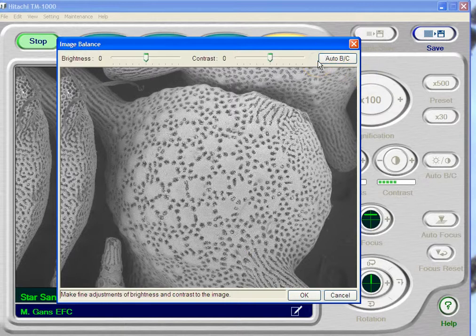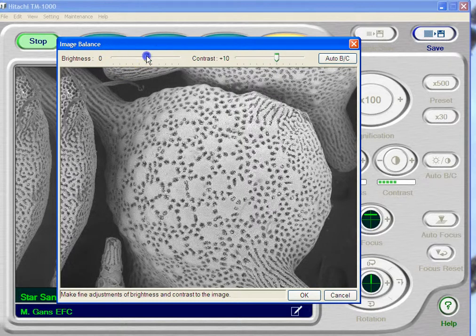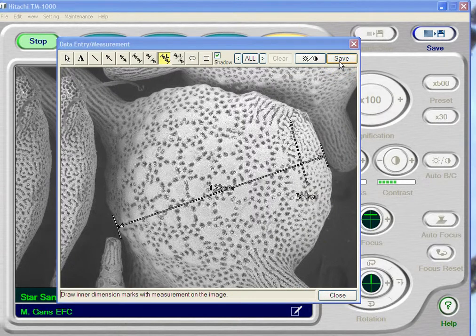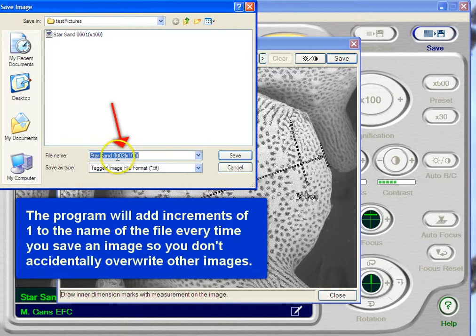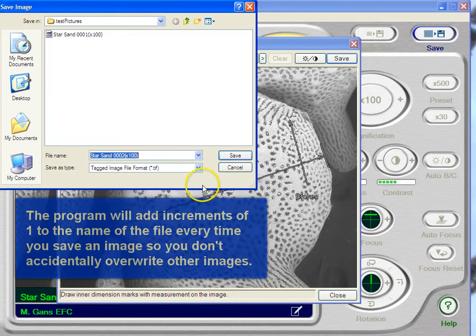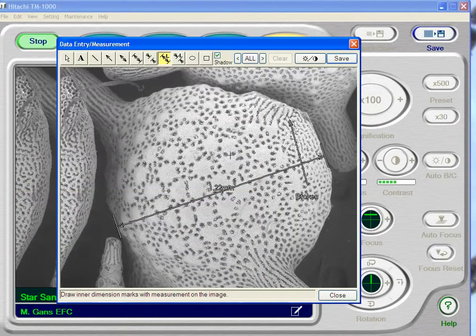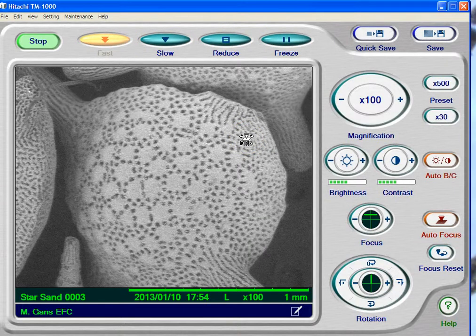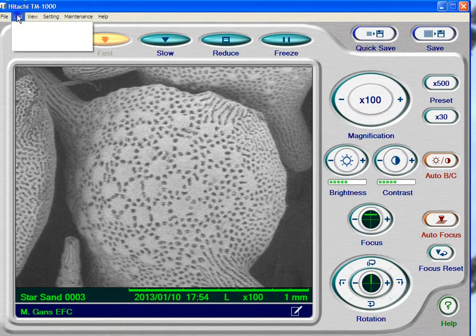Also, I have a little mini Photoshop here. I can come in and adjust the contrast and brightness to get the picture I want, or I can go to Auto Brightness and Contrast and say OK. Then I'm going to save that. It's going to pull up a save menu again — this time it's augmented the filename, so you don't have to worry about writing over your original image. You can have the image without the tag and the image with the tag. You can only do this immediately after you take a picture, because as soon as you hit Fast again, that measurement option is gone.